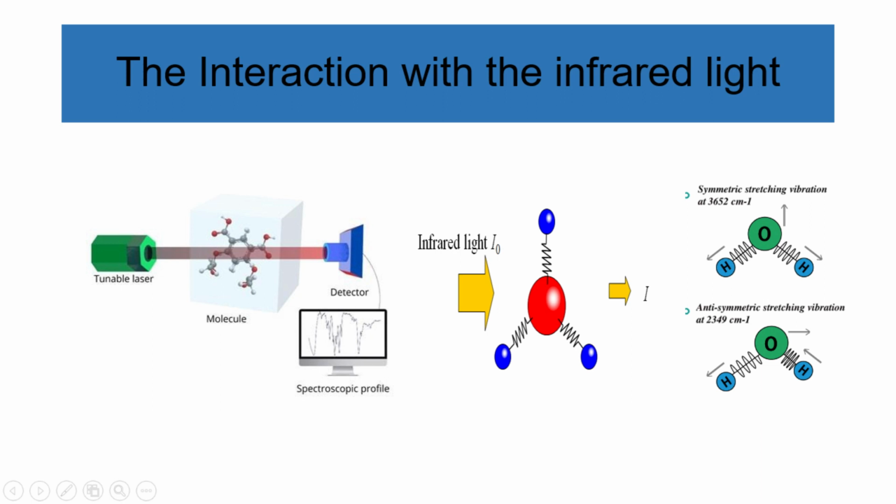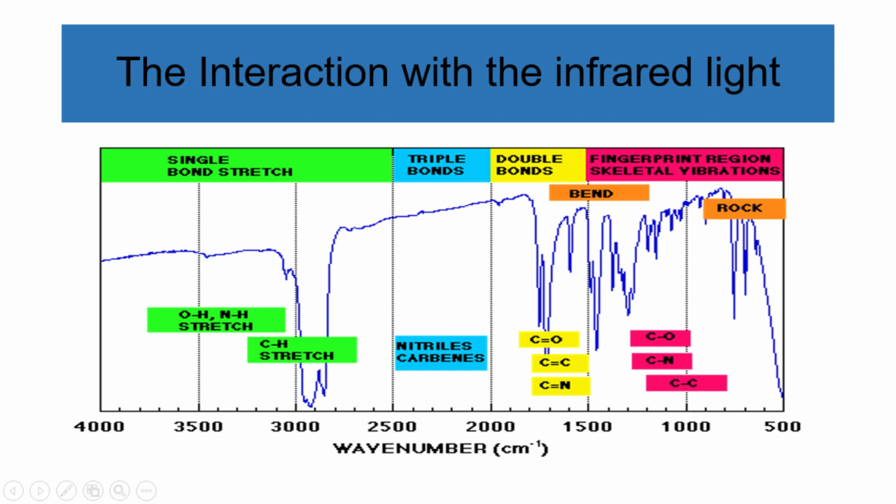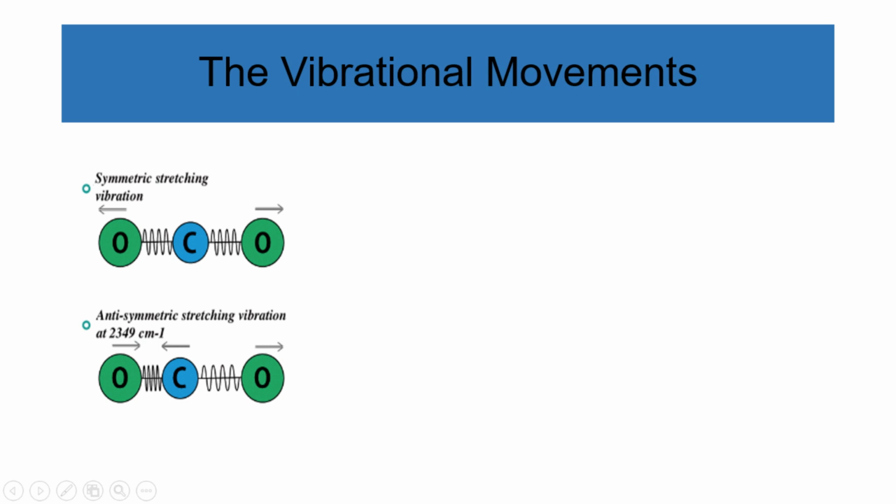The absorption of specific infrared frequencies by a substance leads to generating an infrared spectrum. The infrared spectrum obtained from a sample provides valuable information about its molecular composition and structure. It reveals details about the molecular structure, functional groups, and chemical bonds present in the sample. By analyzing the infrared spectrum, scientists can identify the types of molecules present and gain insights into their arrangement and connectivity. So generally, molecules show two types of movement once they are induced by IR waves.